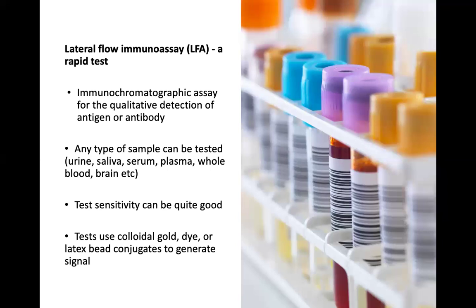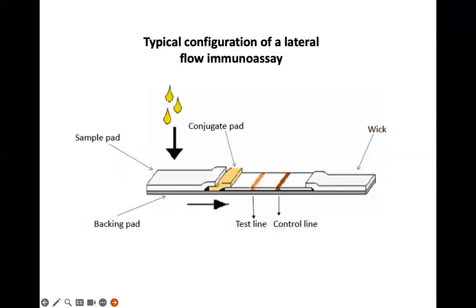It's common, but there are other nanoparticles that can be used, for example quantum dots, carbon dots, and fluorescent ones, which are more sensitive compared to gold nanoparticle. But for the purpose of our training, we focus on gold nanoparticle. So the first is the structure.